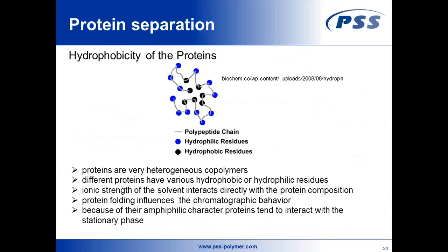So let's talk about protein separation in SEC now in more detail. I have taken this scheme of a protein to show you that these proteins have various hydrophobic and hydrophilic residues along the polymer chain, besides the foldings. And as I have mentioned before, the proteins can be charged, depending on the amino acids used, at certain pH values.